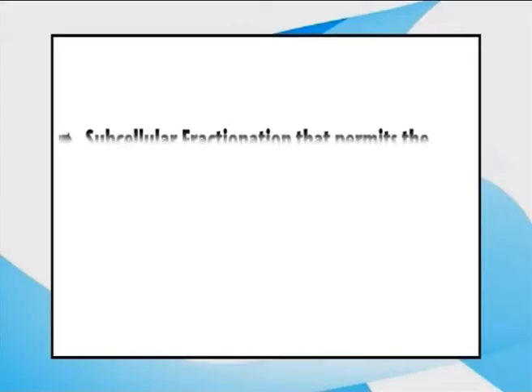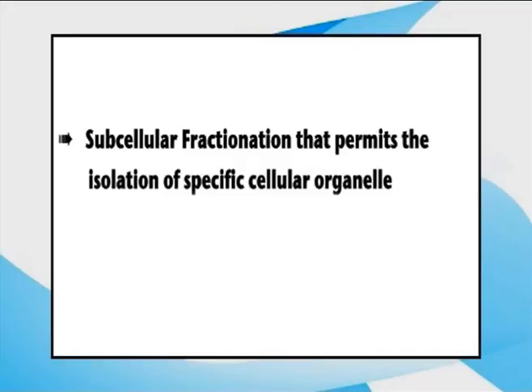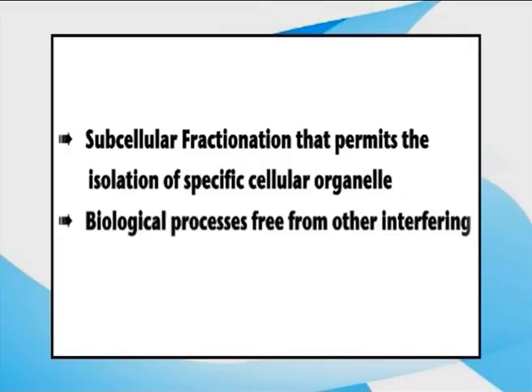Functional studies of these organelles and other macromolecular complexes require detailed observation and manipulation, which is impossible with whole cell. One of the most fruitful approaches towards achieving this goal is subcellular fractionation that permits the isolation of specific cellular organelle and allows us to work out biological processes free from other interfering reactions in the cell without having to worry about keeping the cells alive.